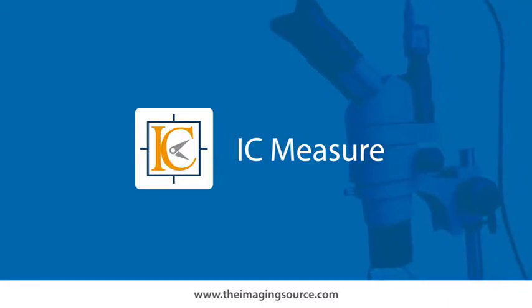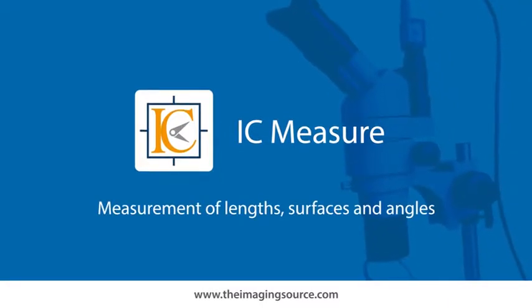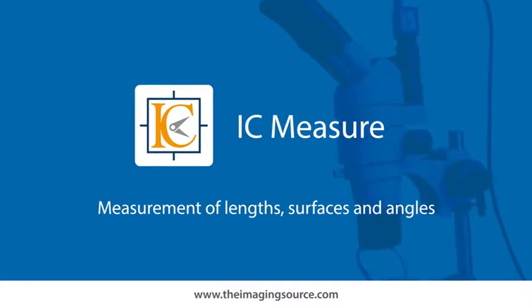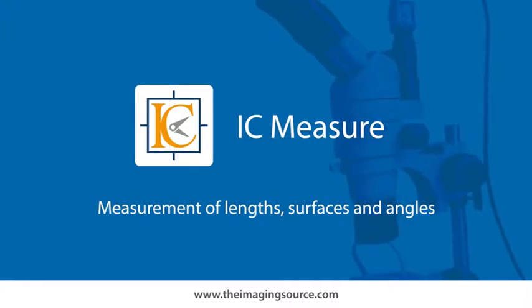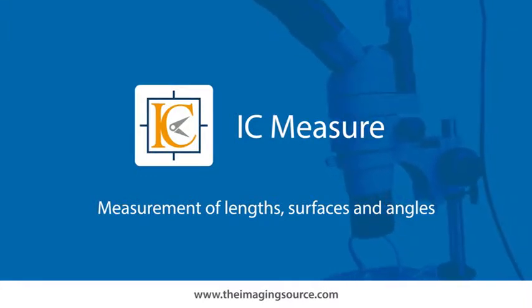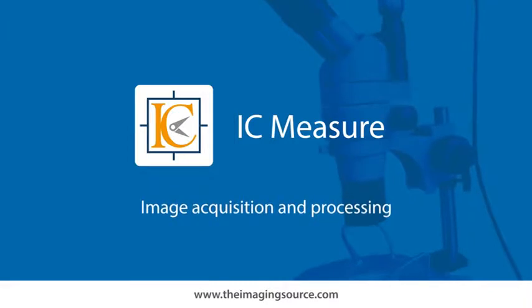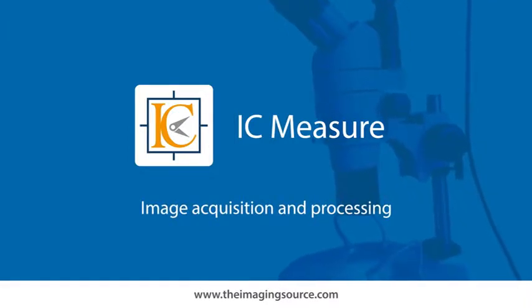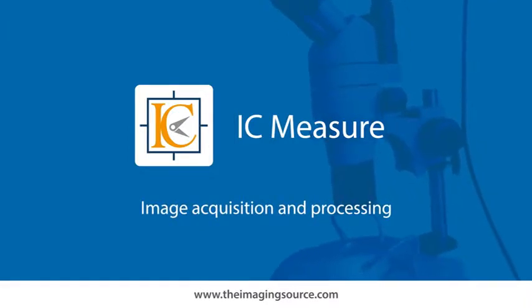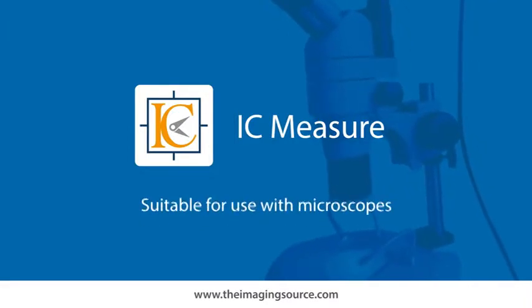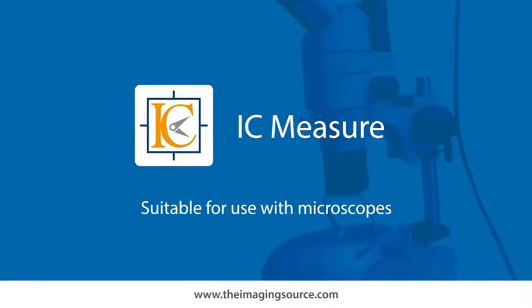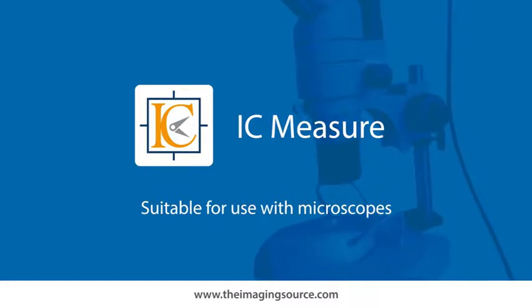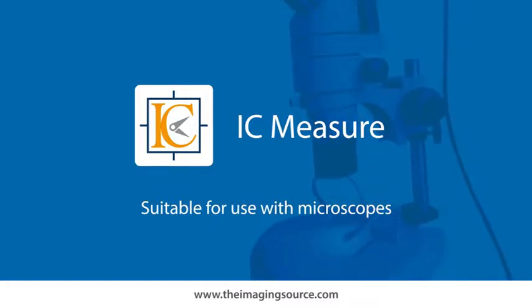With ICMeasure, not only do you have a flexible tool for the measurement of length, surfaces, and angles, but it can also be used for image acquisition and processing. ICMeasure is designed for use in microscopic and macroscopic imaging.